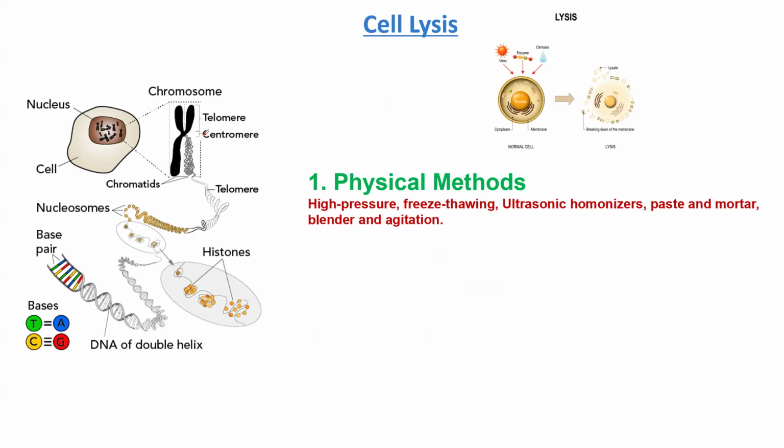You can use pestle and mortar, a blender, and also agitation. All these are the physical methods that are used to break down the cell.